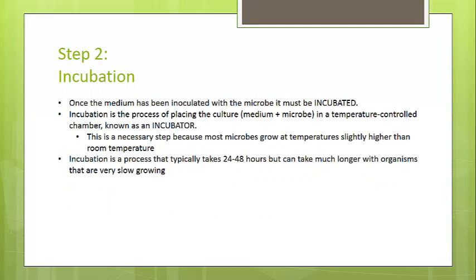The second I is incubation. So step 2 is incubation. So once we've performed our inoculation in step 1, we need to put that media that has the microbe inside it into what we call an incubator and incubate that culture. So incubation is the process of taking the culture, which is the medium plus the microbe, and putting it in a temperature controlled chamber known as an incubator. And this is a really important step because most microbes grow at temperatures slightly higher than room temp. So the incubator is going to make them nice and happy and get them growing really well.